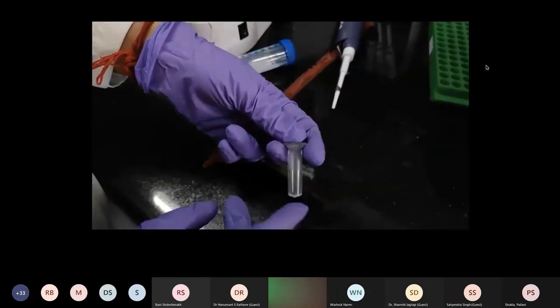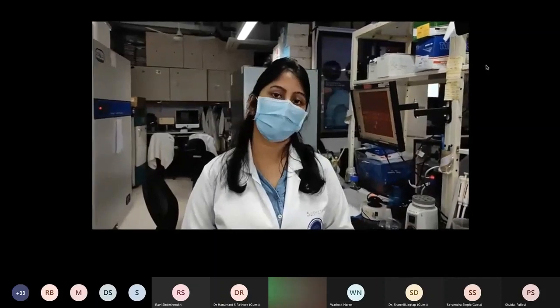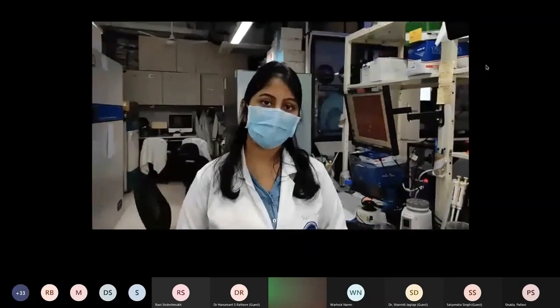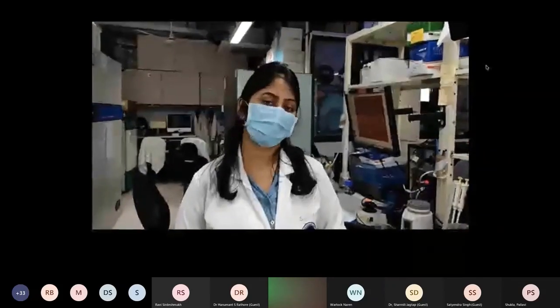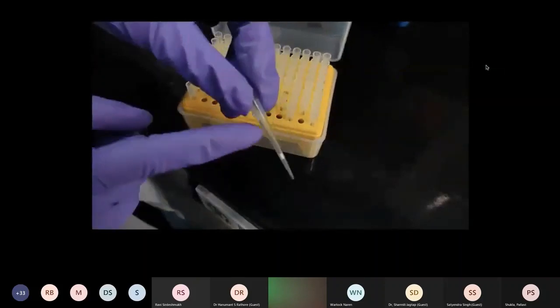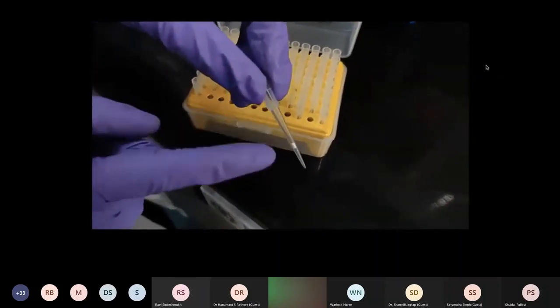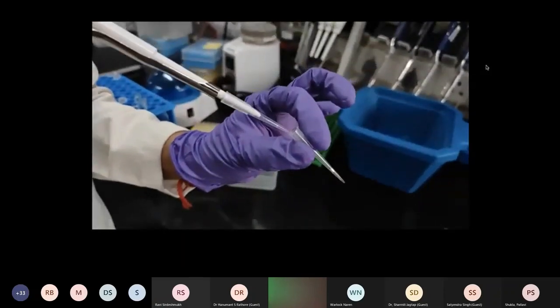For mass spectrometry, the peptide sample should be properly cleaned. To make sure that the sample is clean of various salts or other contaminants, it can be put through cleanup steps. For these steps, we use C18 columns. These columns can be made using the C18 material within tips. And then the sample is passed several times through the column.